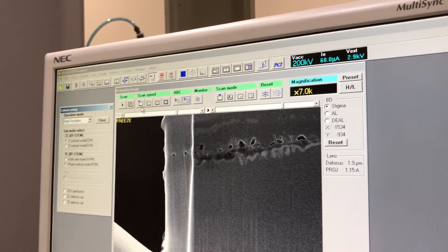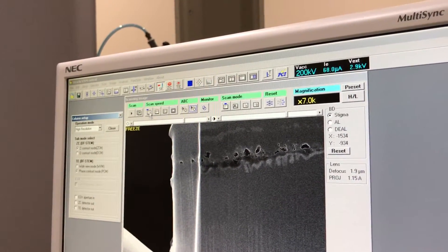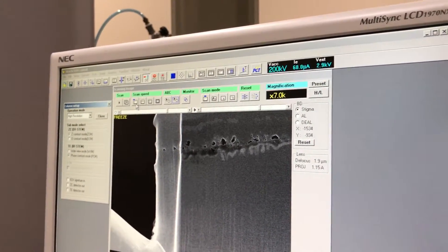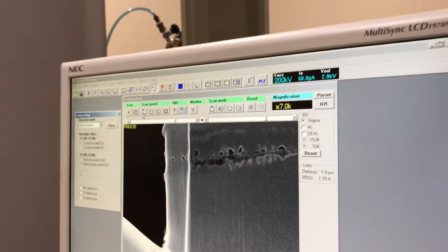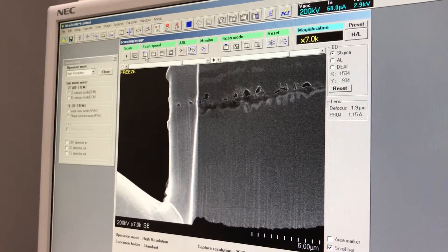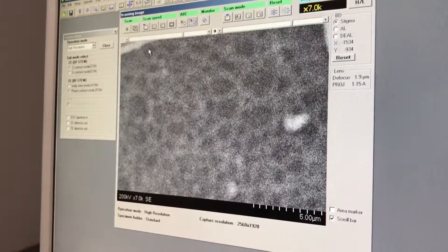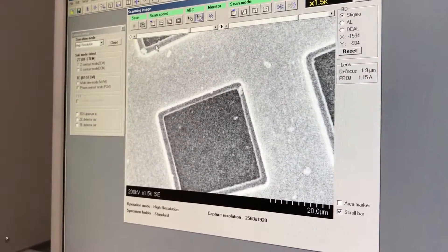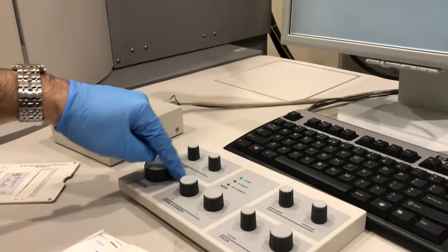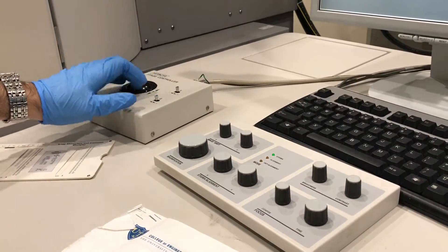If you are familiar with electron microscopy, you have different scanning speeds. You can choose your scanning speed from the available options, and usually you use the fastest one for navigation. So I'm going to do that right now — the fast scan is good for navigation. I will unpause the beam, then I use the magnification knob to decrease the magnification, and by this knob I can navigate on the sample.